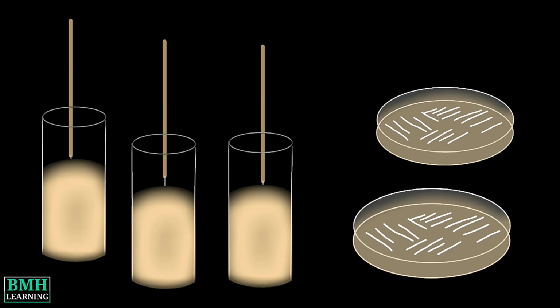For Enterococcus and S. bovis identification, 40% bile is used, and the tubes are inoculated with a 10 microliter calibrated loopful of a 0.5 McFarland standard suspension prepared in sterile water. The cap of the test tubes should be left loosened to ensure adequate aeration. The tubes are then incubated aerobically at 35 degrees centigrade for 24 hours, and the color change is observed.